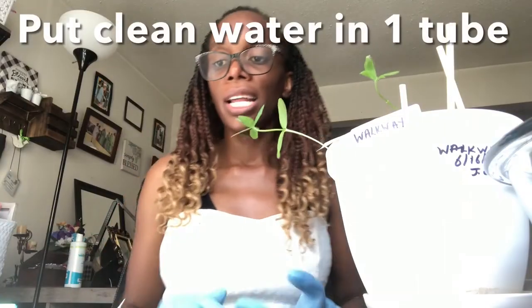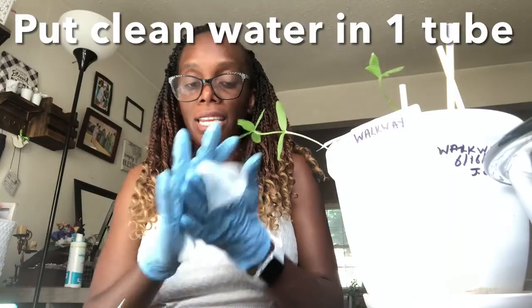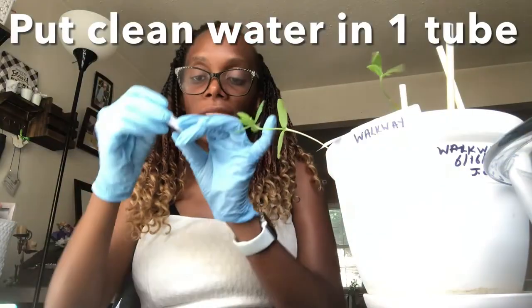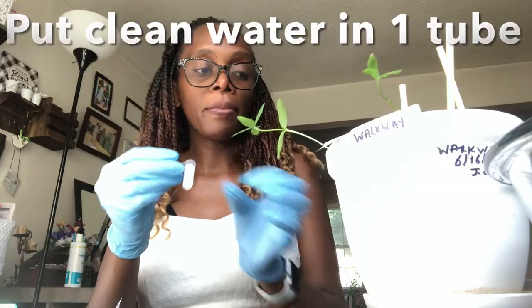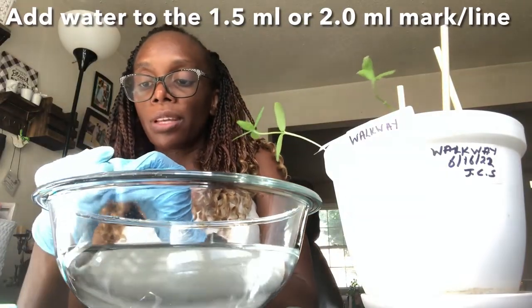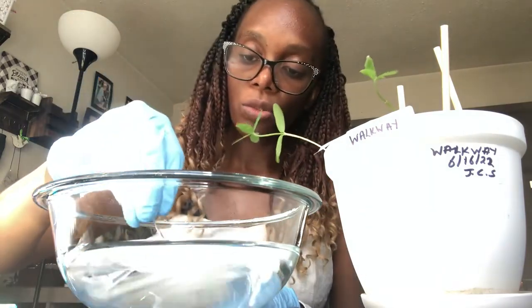All right, so let's fill our 3 tubes with the necessary solutions, the ones I need. So I'm just going to sterilize my hands again. Okay, so one is for clean water. So I'm just going to get some water from my tap, scoop it out, and try to get water up to the 2.0 mark or 1.5 mark. So any of those will be fine.